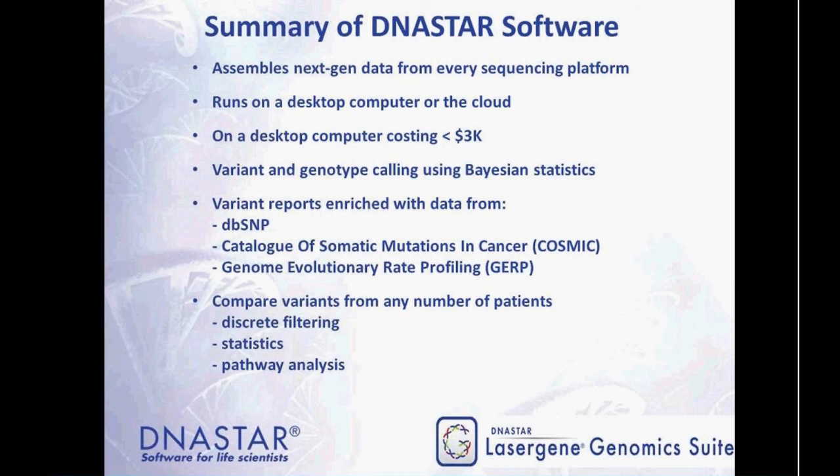And we can pull information in then from a variety of different sources and databases, including a custom database as you begin to annotate your own custom SNPs. And then there's additional filtering and statistics and pathways that we can analyze in ArrayStar for our SNPs and genes of interest. So again, thanks for joining me today. I'll be happy to answer any questions as they come up.